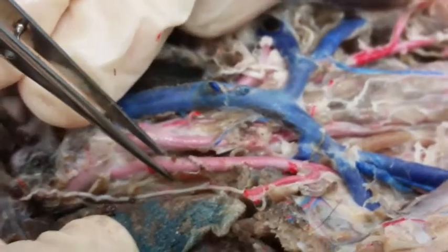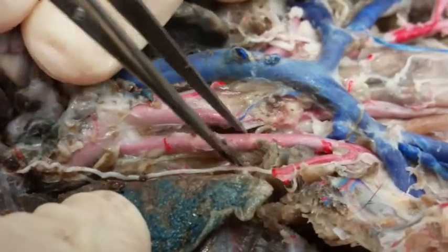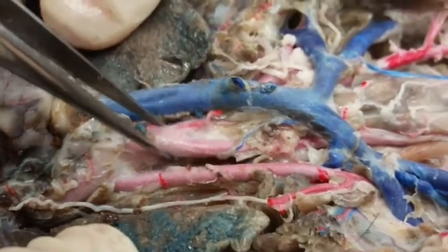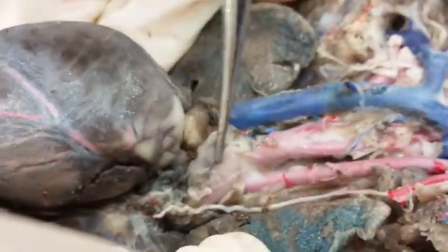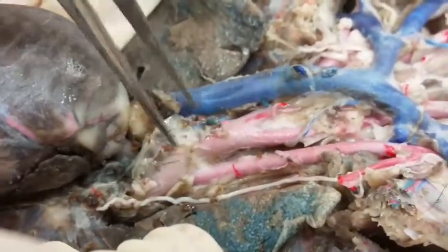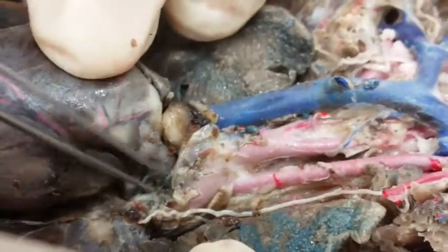Leading up from that, this artery here is the left subclavian artery, and then next to the left subclavian we have the main brachiocephalic artery. Next to the brachiocephalic artery we have the anterior vena cava, and that is close to down here where the aorta is, which eventually branches into the subclavian and brachiocephalic arteries. And then we also have the pulmonary trunk right through there.